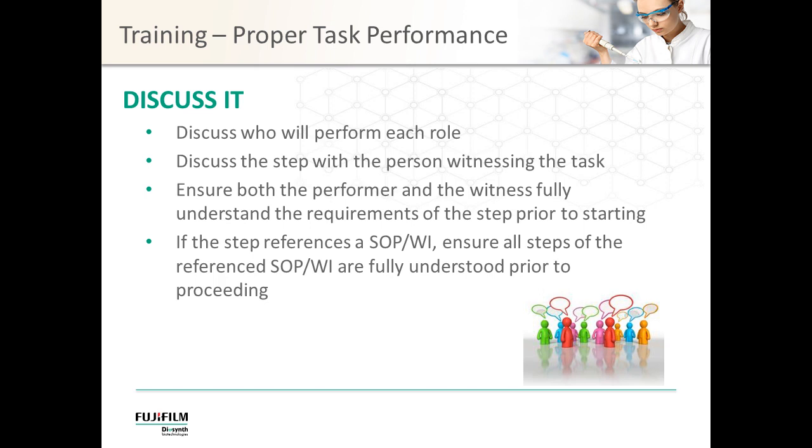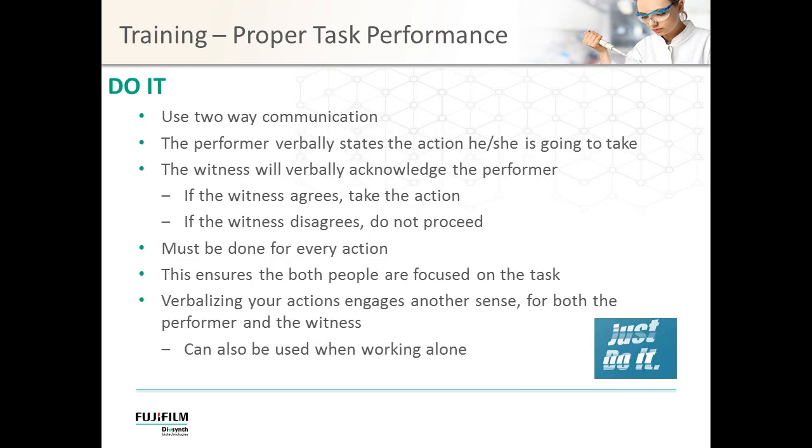This discussion should be tailored to the task. If you're setting up a bioreactor or fermenter, or performing an inoculation, the discussion will be more in-depth than performing a simple task such as sampling. The important thing is to discuss what you're getting ready to do.